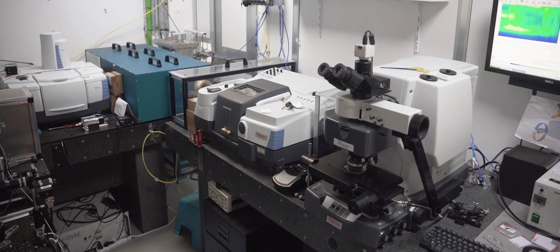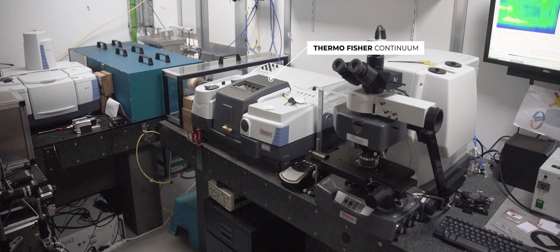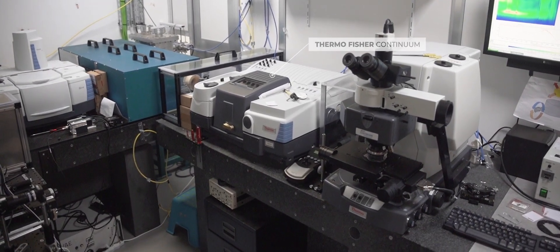The instruments are usually commercial instruments, but combining the commercial instruments and the synchrotron source, we can really achieve a quality of spectrum microscopy that is impossible to do elsewhere.